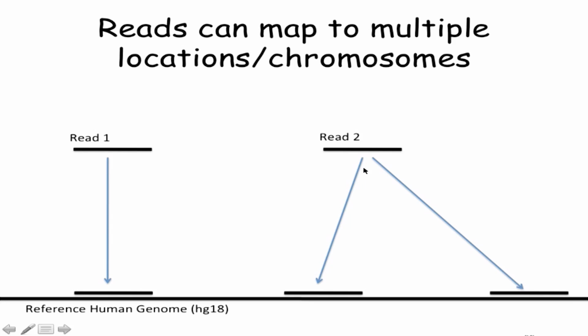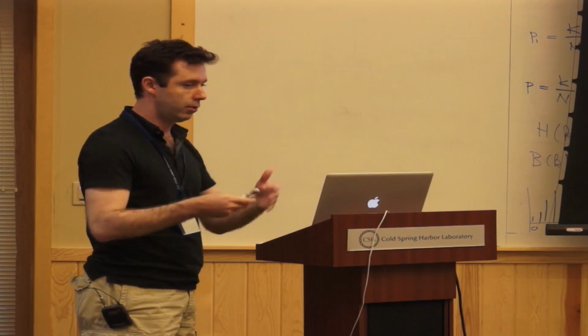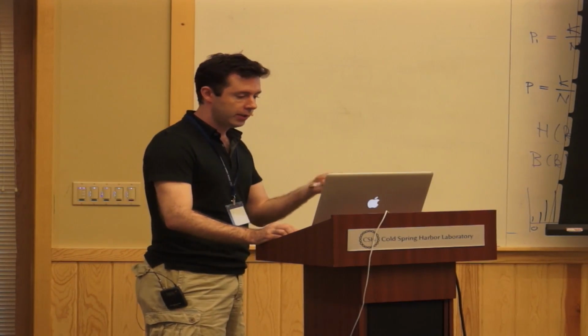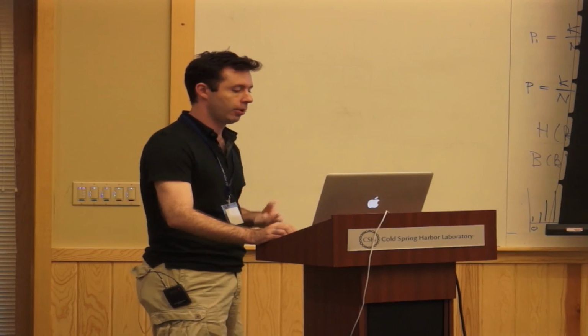With all of these solutions, usually when you have a read that maps to, let's say, more than 20 places, you take the read out because you really have no idea whatsoever where it's coming from. But all of these approaches to deal with multi-mappers apply to ChIP-seq.